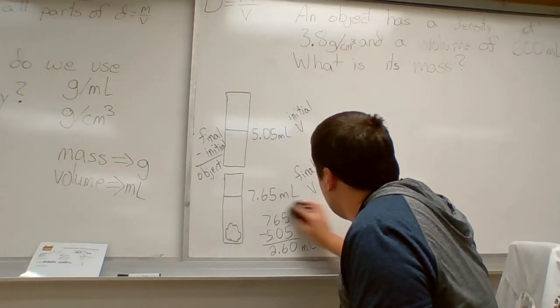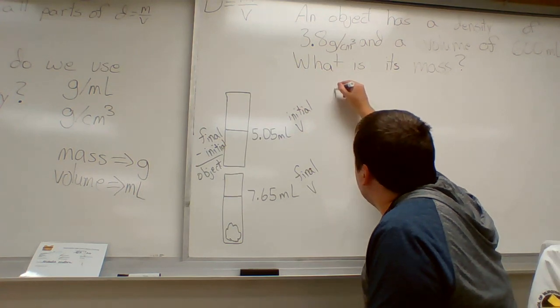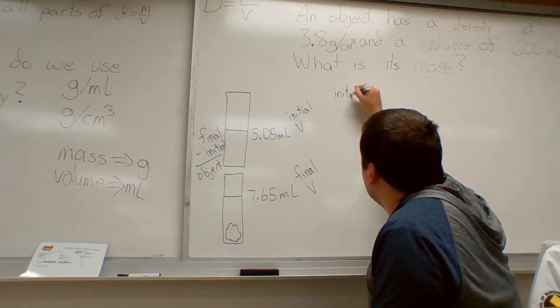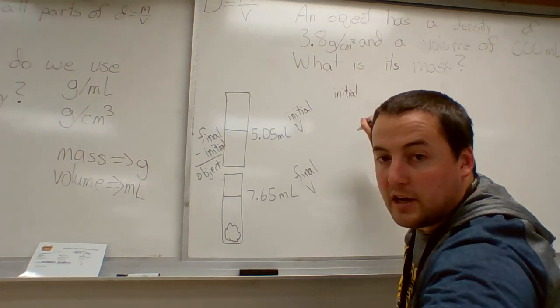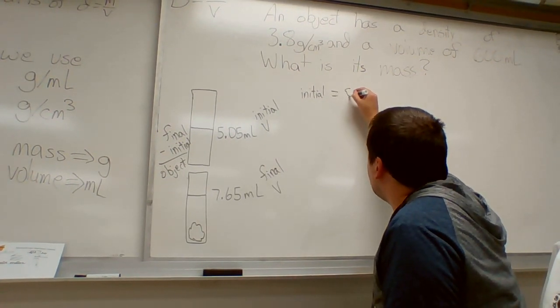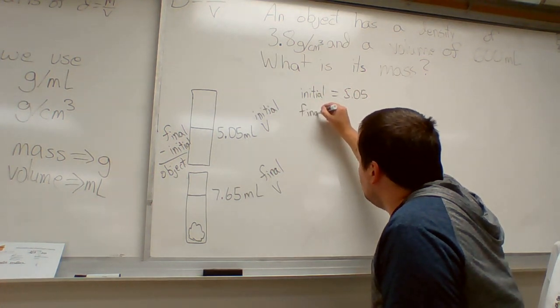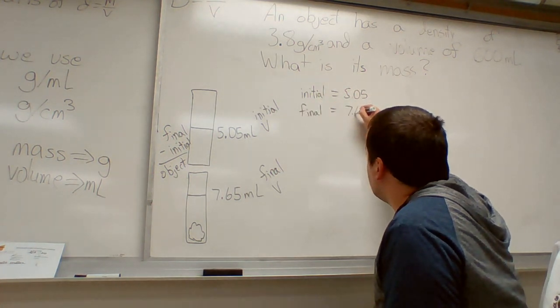You know what, guys? Let me make this a little easier to see. So initial, make sure you guys can still see. So initial was 5.05, final was 7.65.